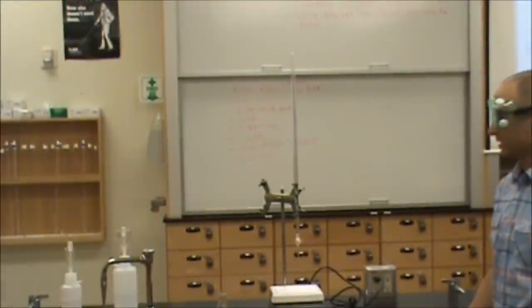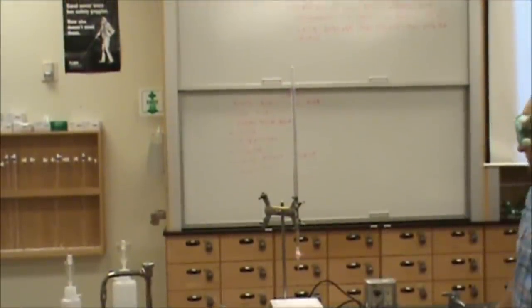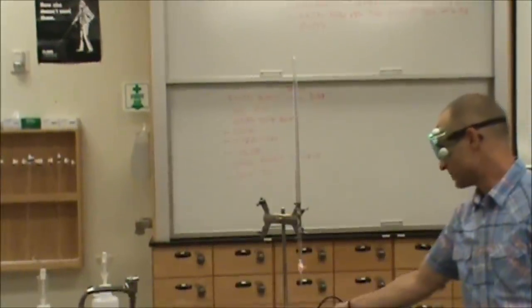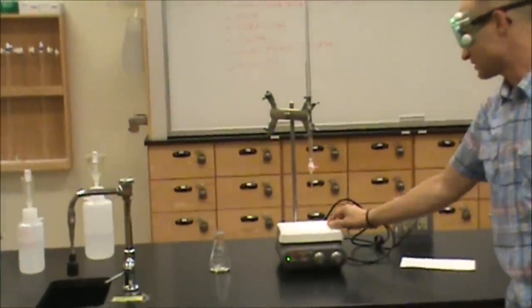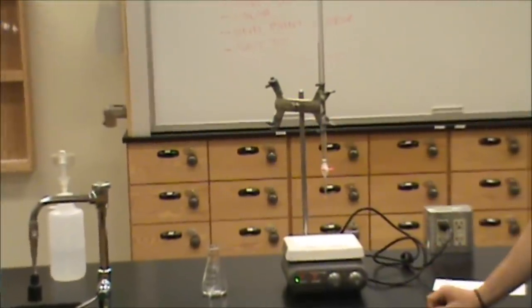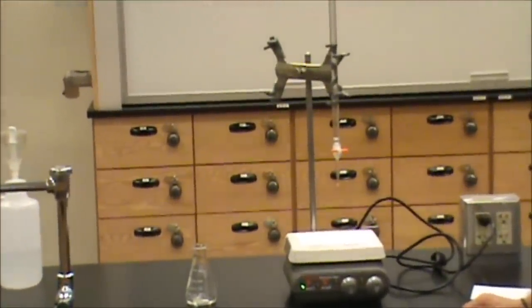We are now ready to start our titration experiment. Before we begin, you may wish to put a piece of white paper down on the top of the stir plate. As many of them are stained, it will give you a good surface in order to see the color change of the titration experiment.